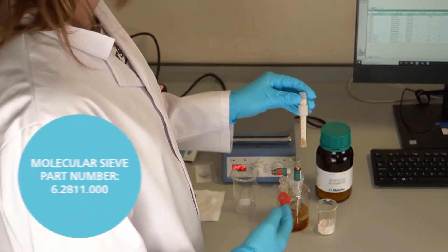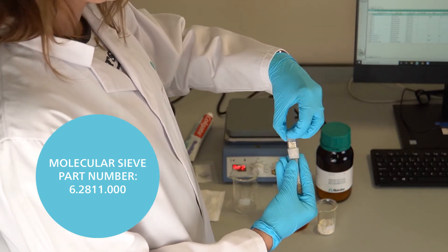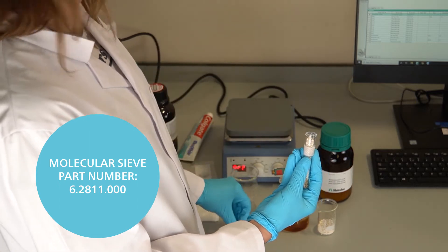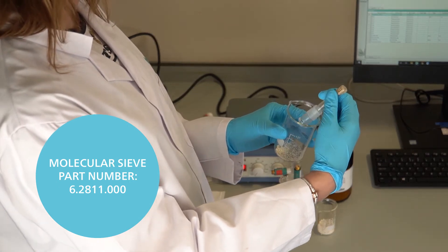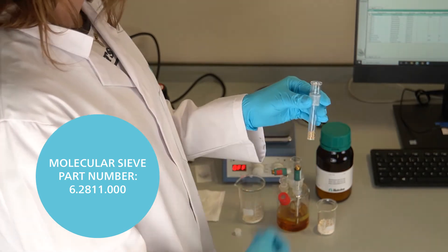Check that the molecular sieve is dry and replace or regenerate if it is wet. Make sure the drying tube is completely dry before adding the fresh molecular sieve. Remember to leave a small gap at the top of the drying tube to allow gas to escape from the cell. Good practice is to replace or regenerate molecular sieves every six to eight weeks.